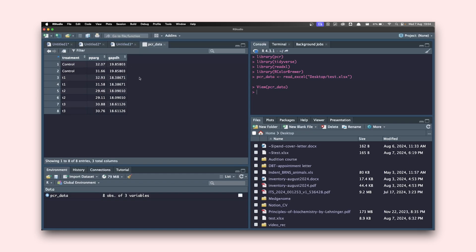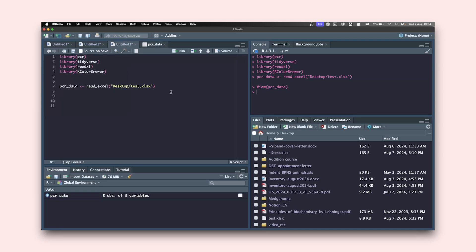The problem with this table is that when I feed it into the PCR package, it's going to take the first column as values too and throw an error, because that column does not have any numeric value. So I'm going to clean this up and get rid of the first column so that I have only the second and third columns. To do that I'll use the select() function from dplyr, which comes from the tidyverse group of packages.